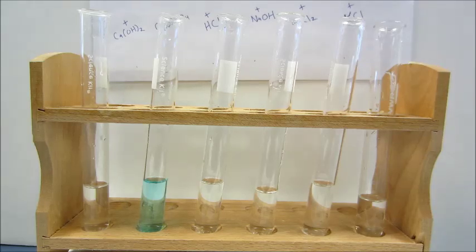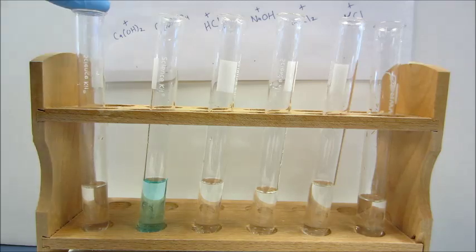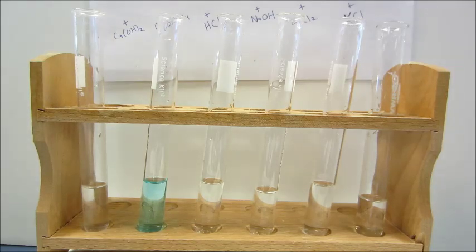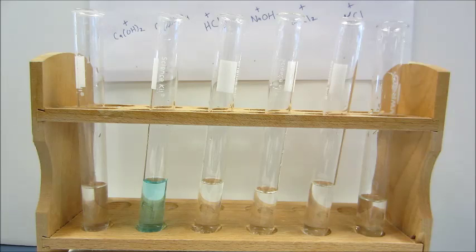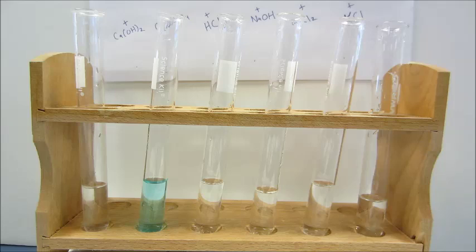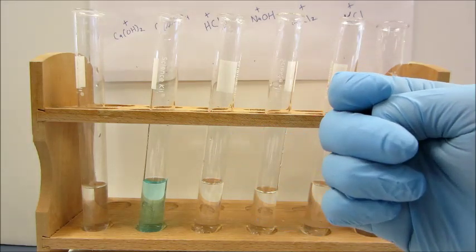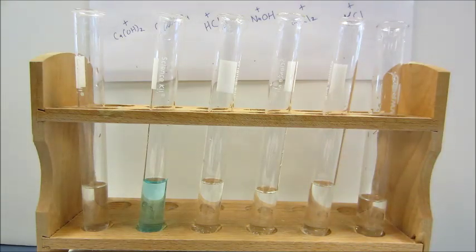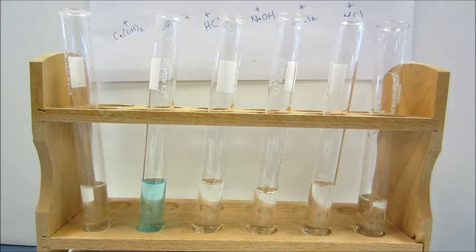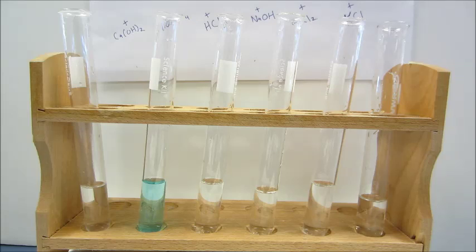So the salt water didn't react with any of the six other compounds. Let me explain why. In our first test tube, we've got calcium hydroxide and salt water. Sodium chloride could react with calcium hydroxide, but we'd get calcium chloride — which is water soluble — and sodium hydroxide — also soluble. A double displacement reaction will only occur if a gas, a solid, or a covalent compound such as water is formed. That first reaction met none of those criteria. The second reaction — copper sulfate and salt water — would form sodium sulfate and copper chloride, both of which are water soluble. So no reaction.